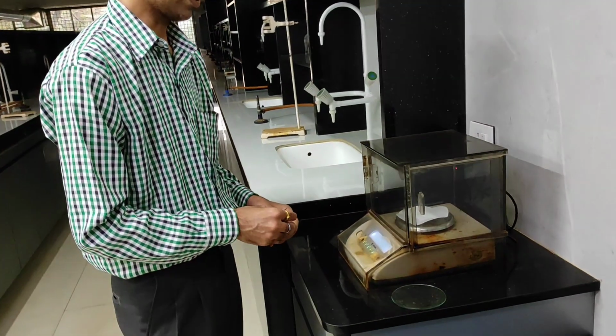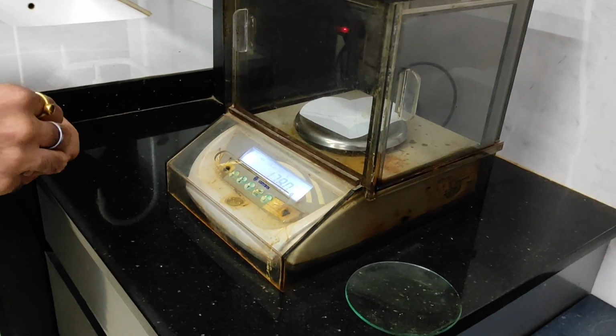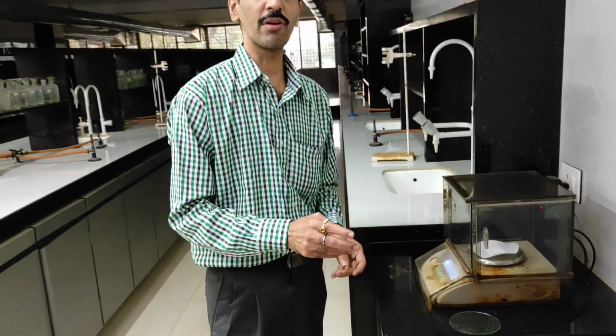So you can check this weight, it's 1.780. So we had W1 as 0.820 and this is 1.780. If we find the difference between the two, we get 0.960. And my dear friends, this 0.960 is going to be the weight of BaSO4. I hope you have understood up to this very well.